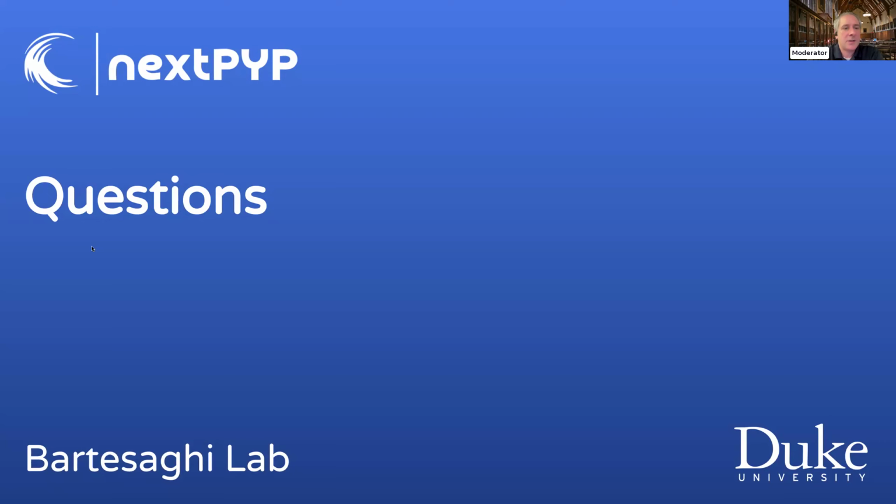Okay, there's another question related to the neural network picking. It said, how can I give nextPYP the particle list to train the neural network? Is there a detailed tutorial on that? I don't think there's a detailed tutorial on importing your own list, if that's the question. If it's doing the manual list within nextPYP, we will definitely be covering that during the practical, so you'll see how that works.